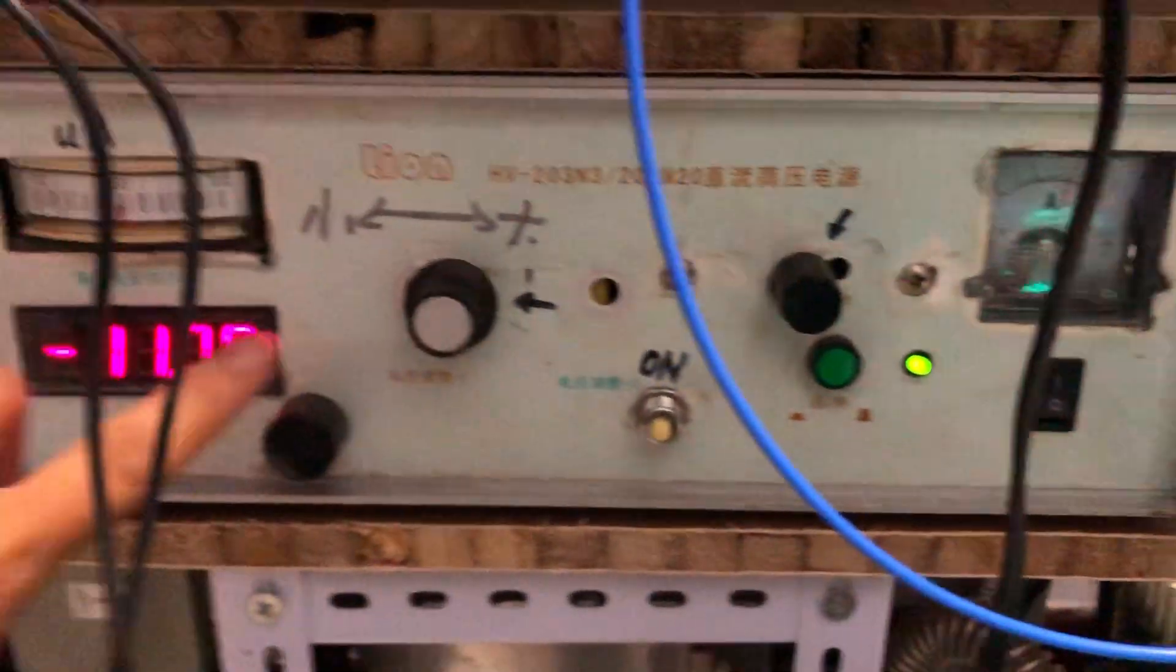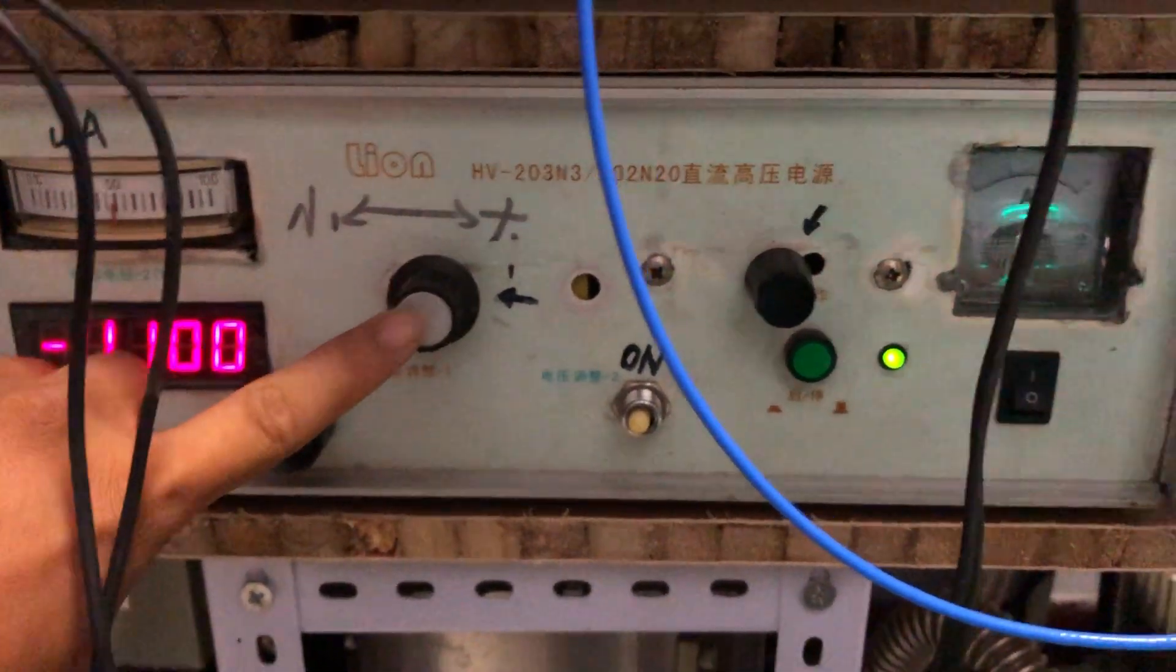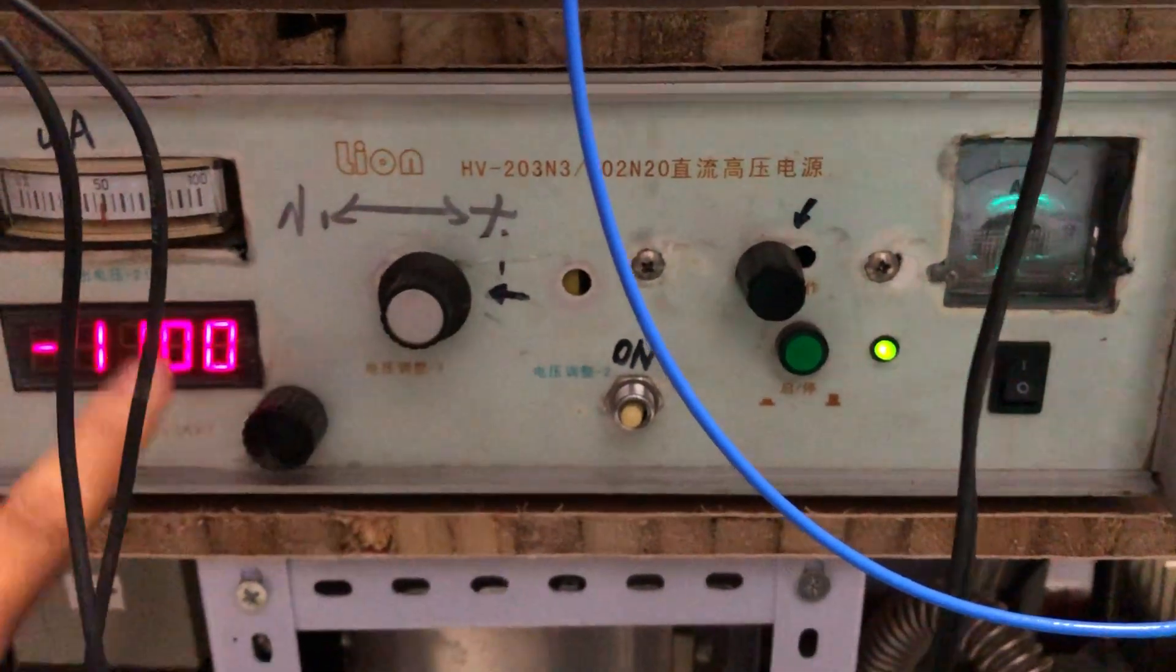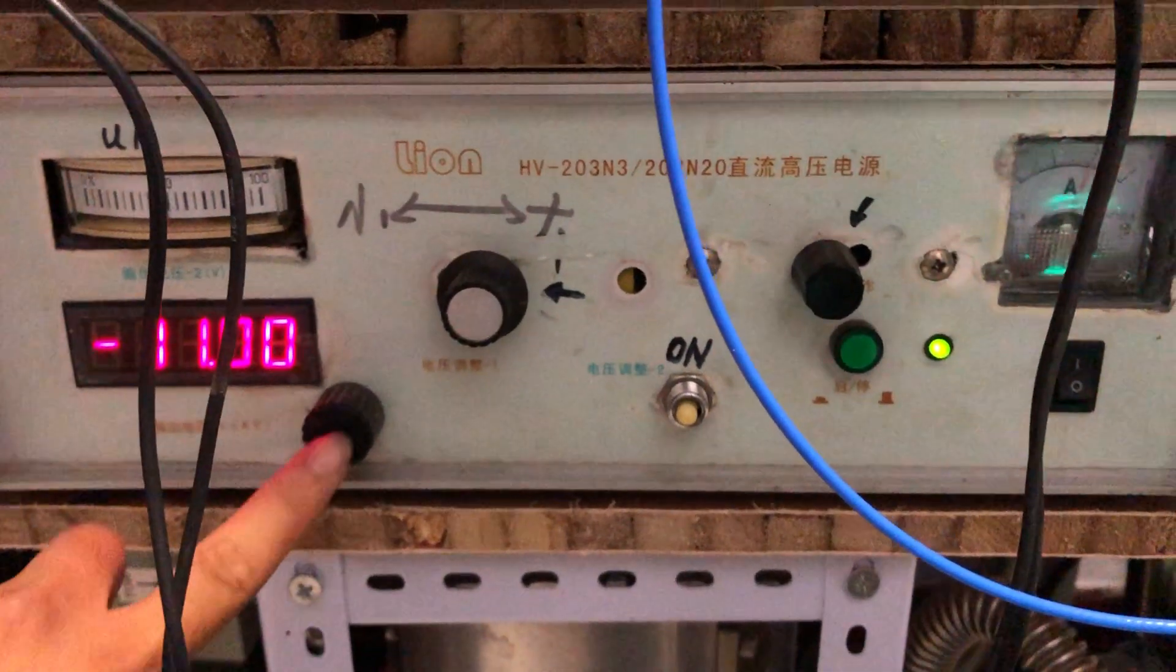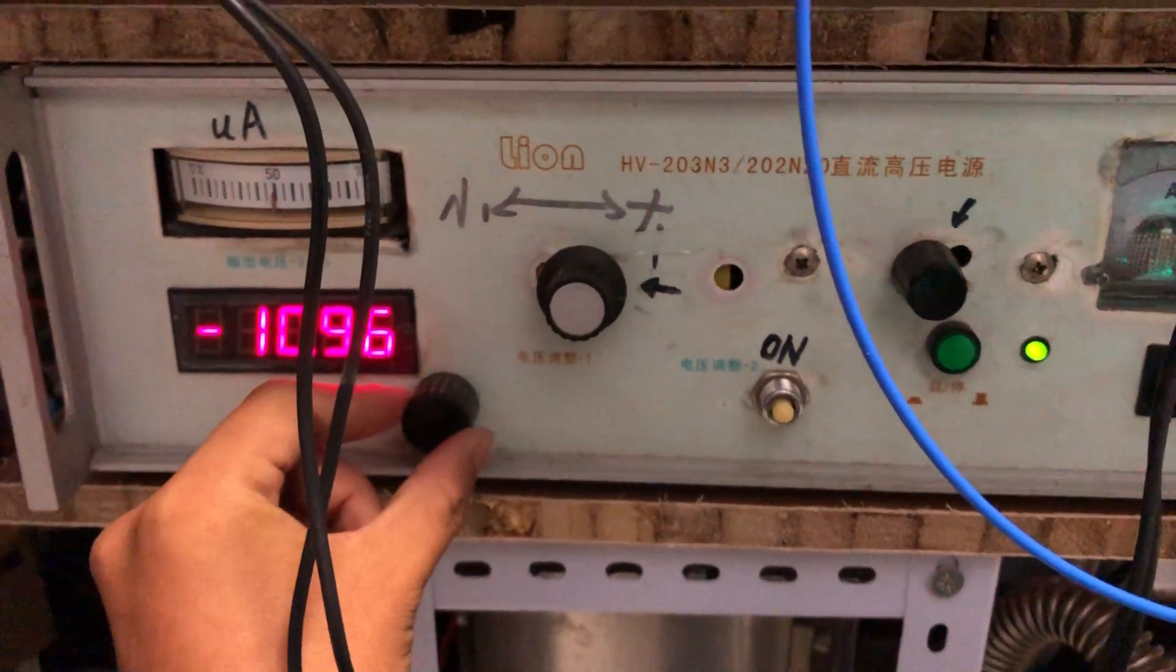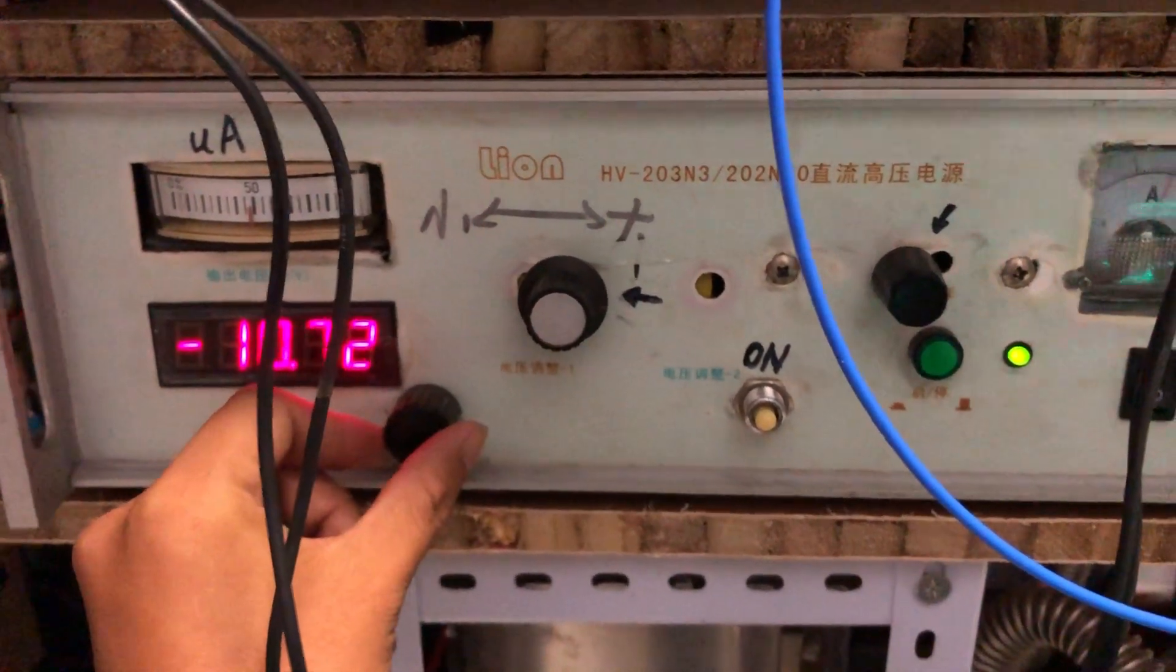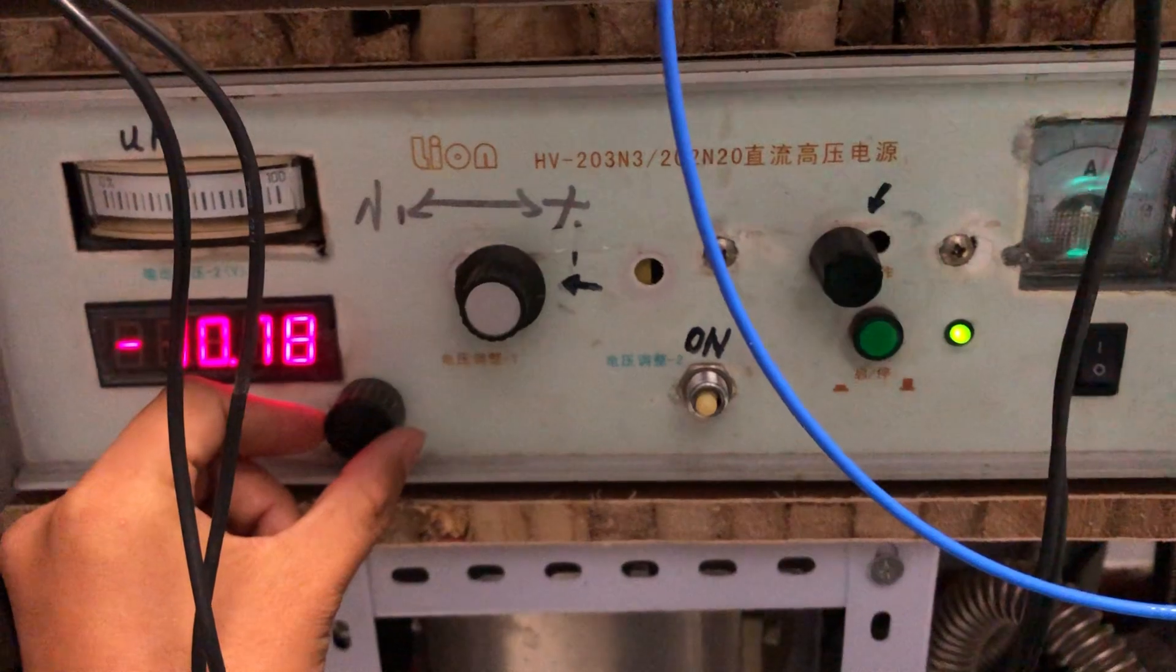Here is the filament voltage control. Here is the high voltage control. I can turn it on and off.